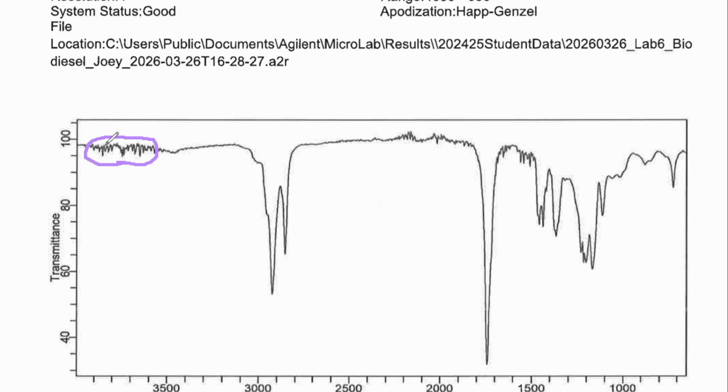Every once in a while, the IR baseline gets a little bit noisy, and if I don't re-zero it and too many students have gone taking their IRs, you might see a little bit of this stuff, but this is not really a signal here.